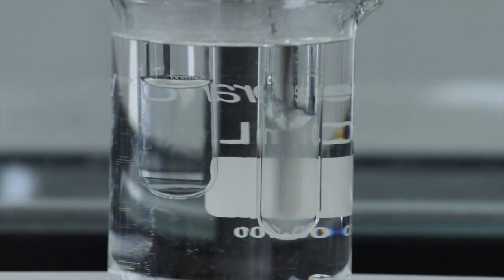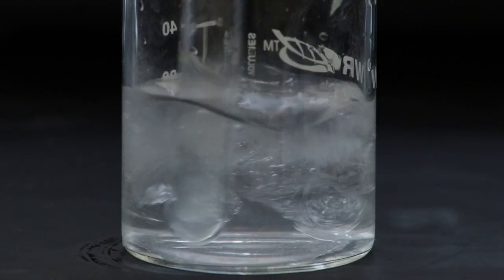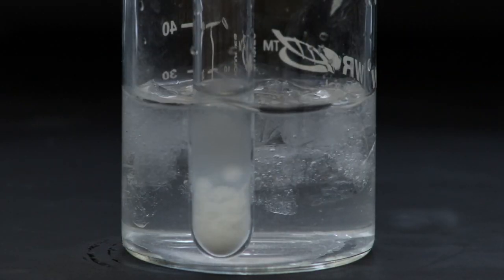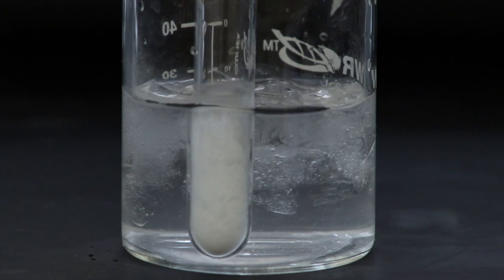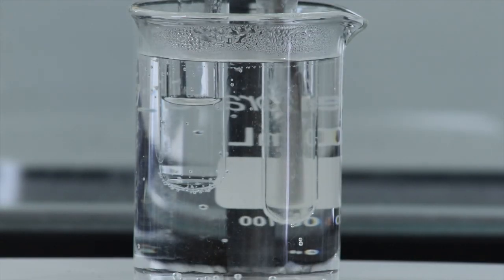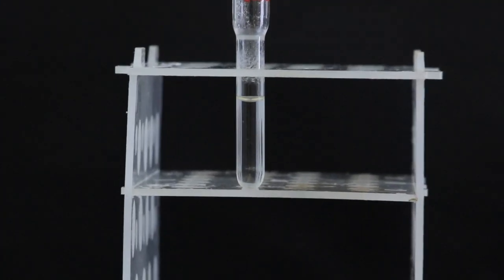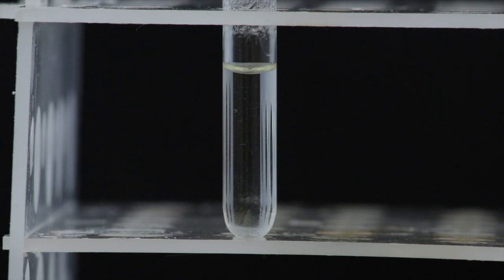Which is looking like everything is dissolving pretty well now, so I'm going to put it into an ice bath to make sure that the solid can come out of solution, which it definitely can, so that's good. So I'll place it back in the hot water bath to dissolve the solid once again, and now leave the tube on a rack so that the crystals can form slowly at room temperature. Now, this clip is really sped up. In reality, it took about 8 minutes for the crystals to fully form.